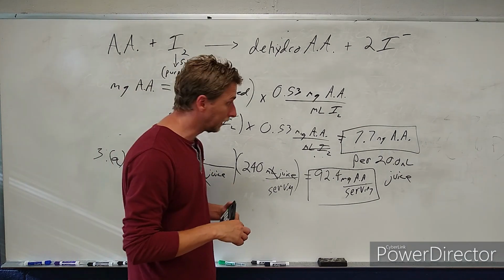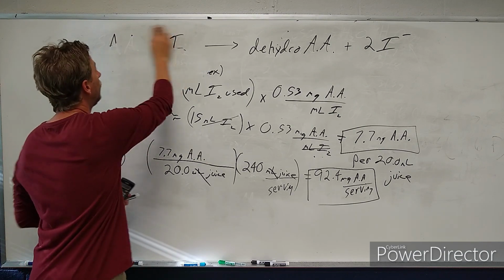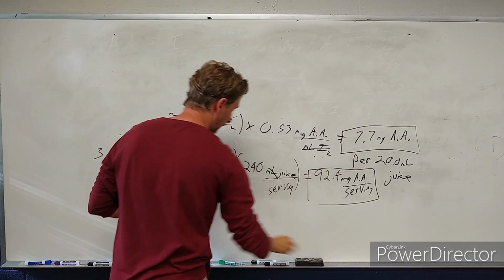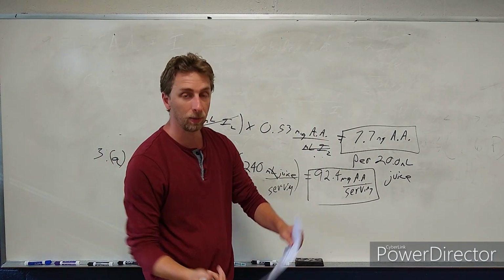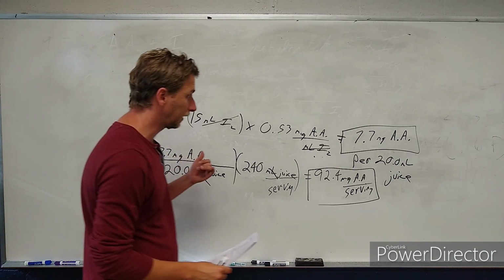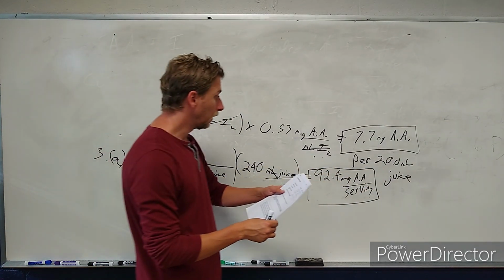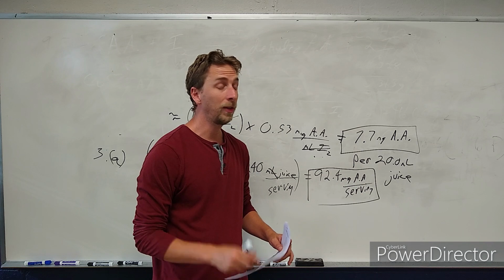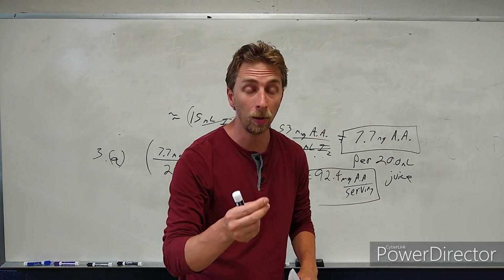Okay, the next part of the calculation, though, is perhaps more interesting, you could say. I'm going to go ahead and put that up here and say, well, it says, show whether or not your results support the claim on the label of the fruit punch. Well, if we again found 7.7 milligrams for our experiment per 20 milliliters of juice, does that support the label? Well, it says 92.4 milligrams of ascorbic acid per serving, but the bottle says there's 130% vitamin C per serving. And when it says that on the bottle, it means per bottle.